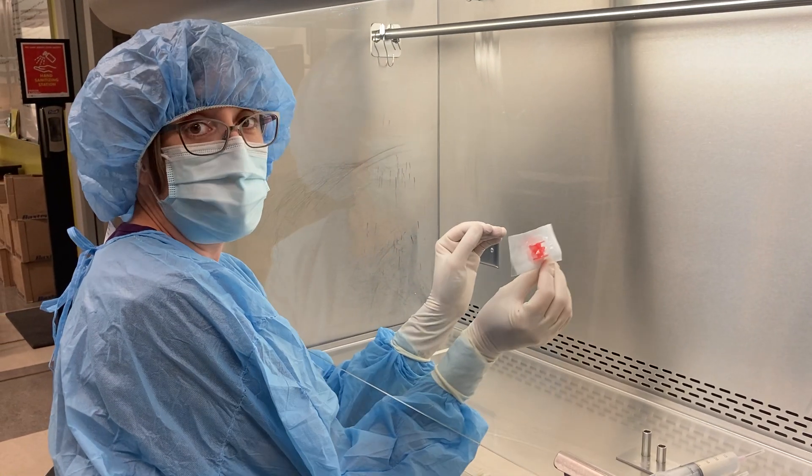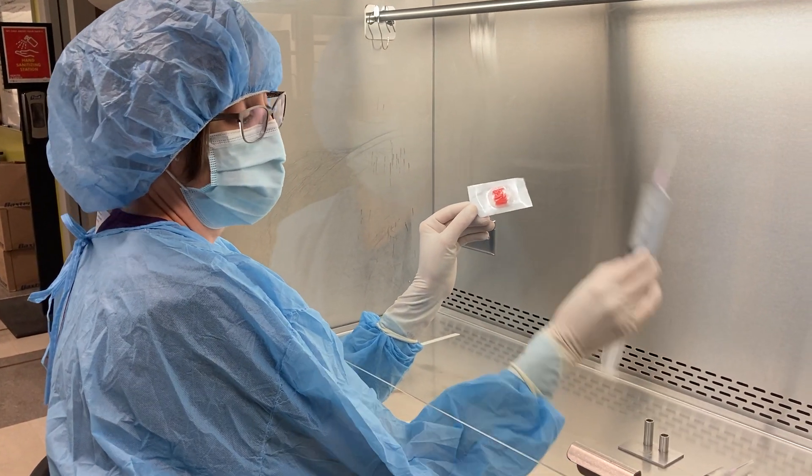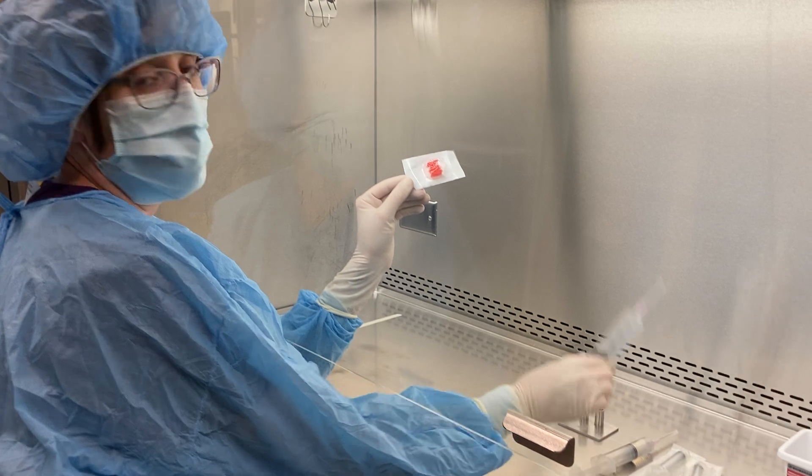Now we are going to use a RapidFill connector to combine both your sterile water as well as your medication into one syringe.